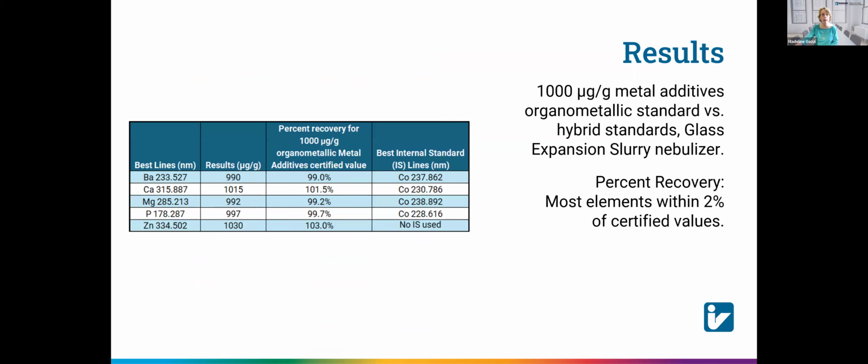This slide, we have the multi-element metal additive standard. This was at 1,000 micrograms per gram. Again, the percent recovery within about 2% of the certified values for most of the elements.